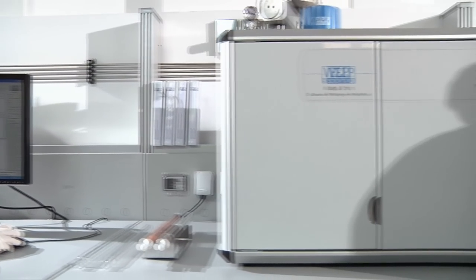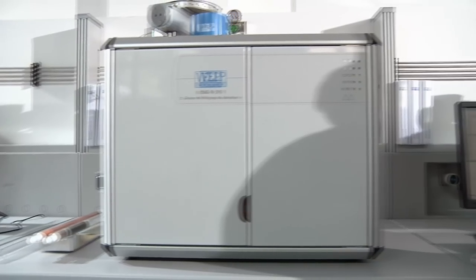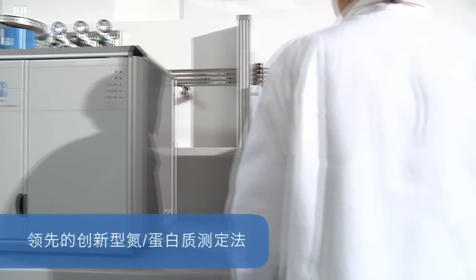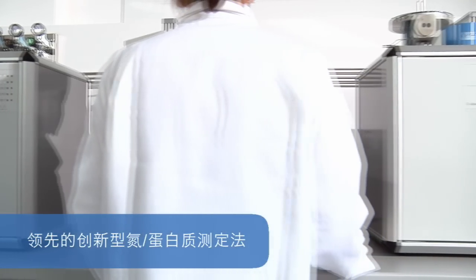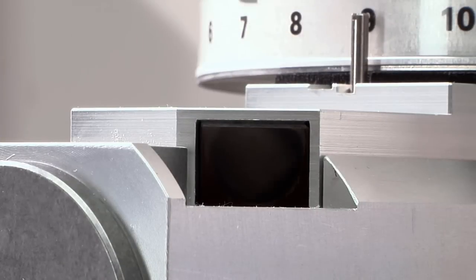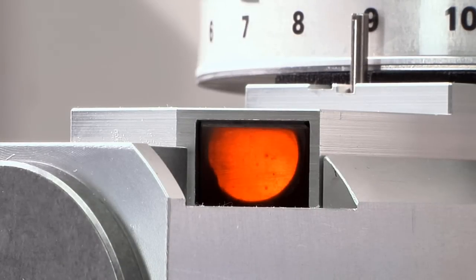The VELP-Scientifica NDA 701 Nitrogen Dumas Analyzer is a completely innovative step forward for nitrogen and protein determination using the Dumas technique, also known as the combustion method, and offering excellent performance on liquid, paste, and solid samples.